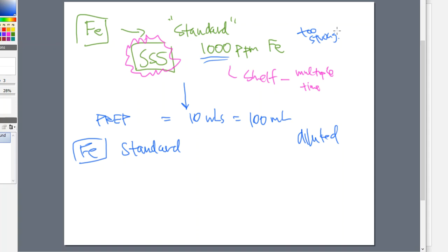We've done that in one of our lab experiments, right? We had blue solutions. You diluted some of it, made them weaker, weaker, weaker. Well, that blue solution that you used in the very beginning, that was maybe our stock standard solution. That was a little tiny jar. It had the most concentrated solution in it. You grabbed a hold of it, and you used that to make other things with. Okay, that's way too strong. We had to dilute it down. Maybe Kim did this for you, right? Maybe Kim took a stronger solution, diluted it down, and put them in little bottles to give to you.